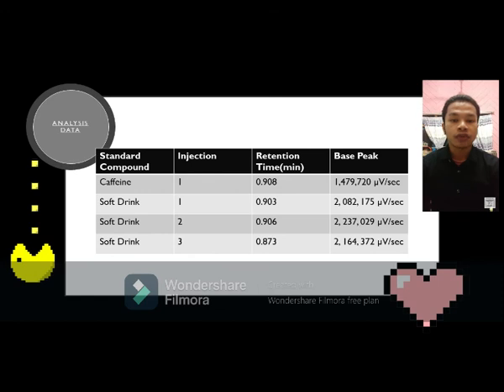When the retention times of the components are very similar or extremely different, not every compound will be seen in the chromatograms. When solvent polarity is varied throughout the run, this is known as a gradient run. Gradient conditions can be optimized to improve the chance that all the components will be seen on the chromatogram. While all the retention times are not as comparable due to varying conditions, it is useful to see how many compounds are in the mixture and to characterize the compounds.